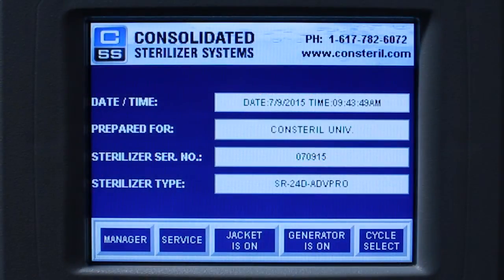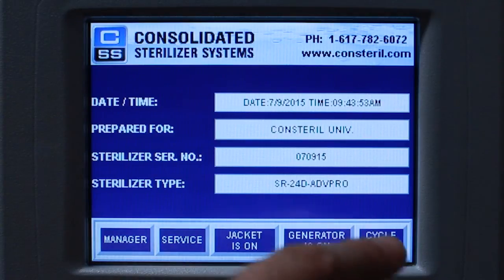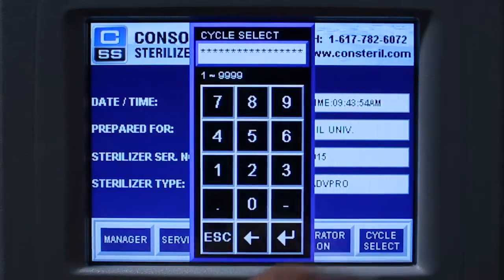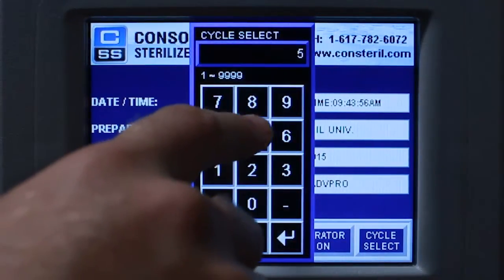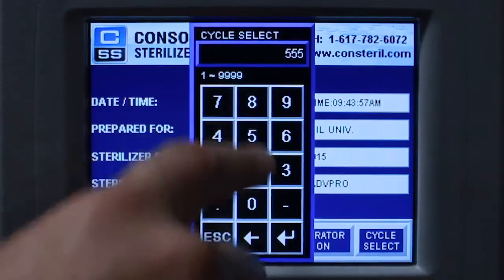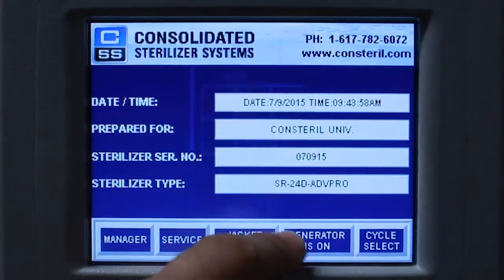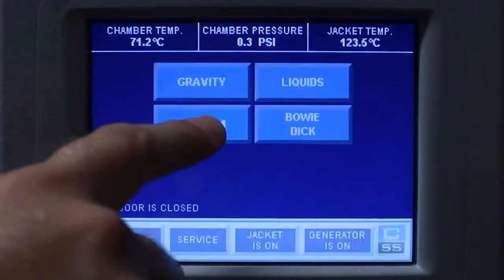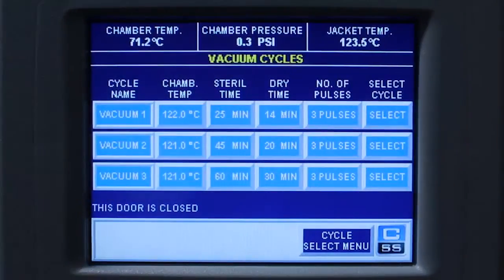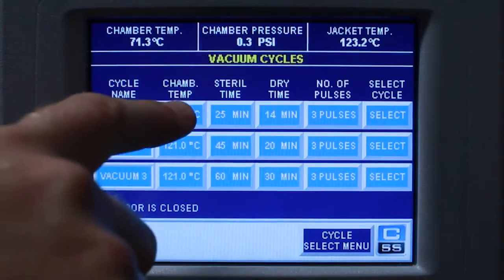To start a vacuum cycle on the Advantage Pro control system, press the cycle select button on the main menu. Enter your operator passcode on the number keypad and press the enter key. Select the vacuum cycle. Enter your chamber temperature parameter.